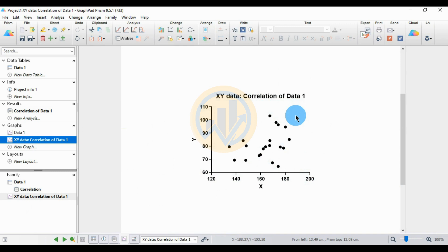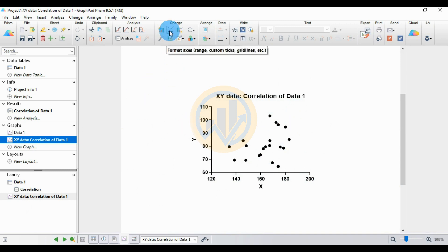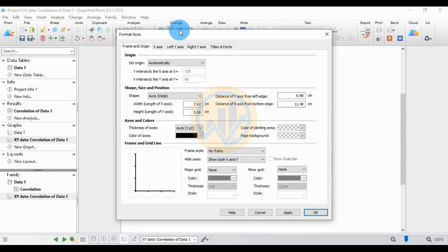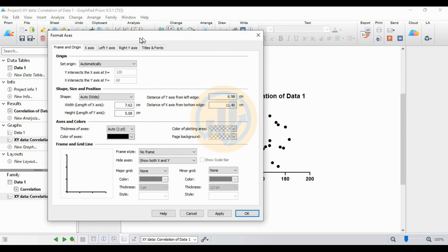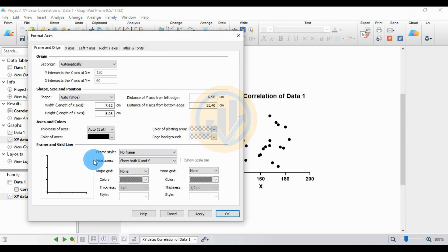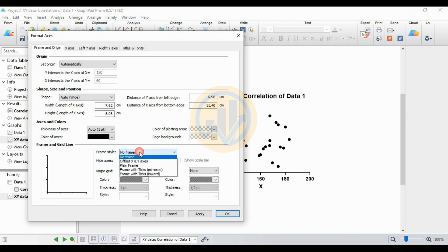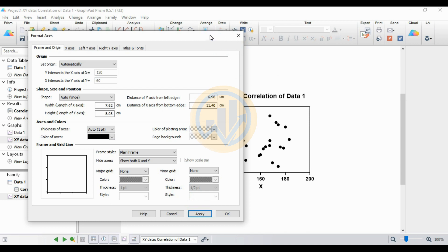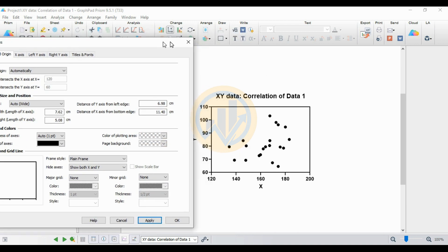Now we will format the graph with a plane frame style. Choose the Format Axes button, which opens a new tab. Select the format style as Plane Frame, then click Apply.